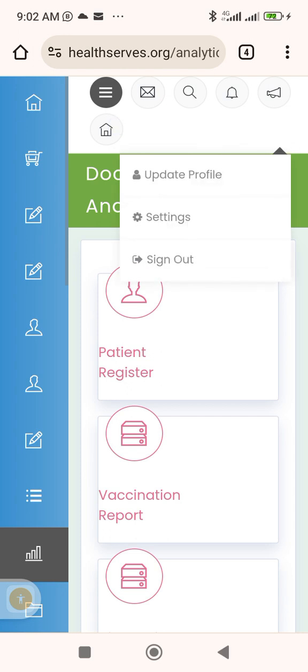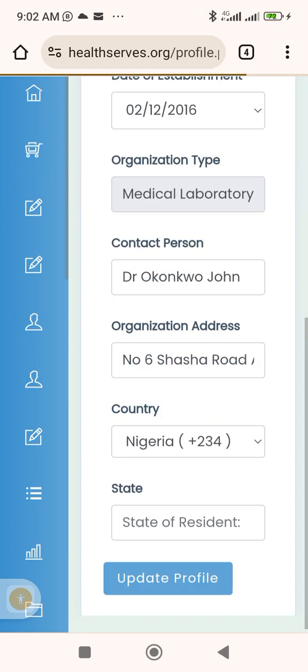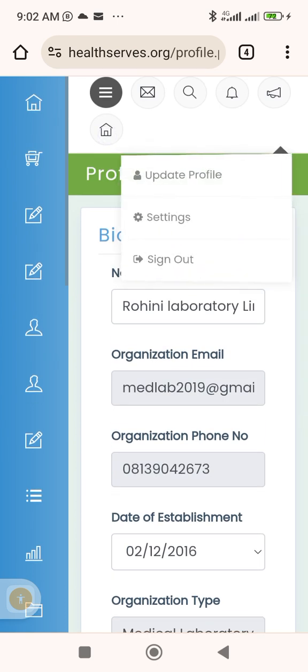So I click on this icon that is shaped like a half shape. Is that the logout icon, and also is where you update your profile and even put your logo. I mentioned that before. So before I log in, let me just show you. This is where you can update the information about your institution, and it's also where you change your logo.